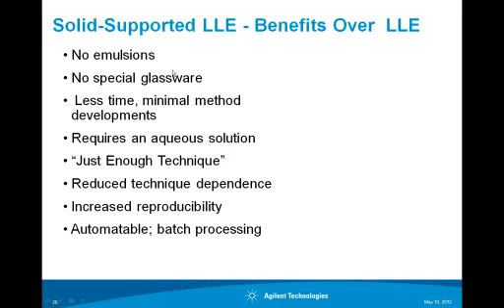It is a just-enough technique, just like we saw with protein precipitation. It reduces technique dependency. You will not see variances between different people doing it or different labs, increases reproducibility, and can be automated.